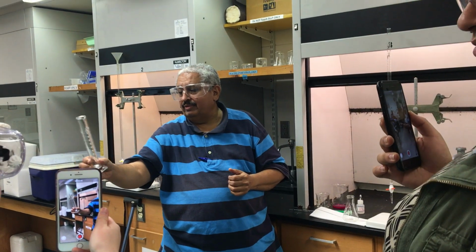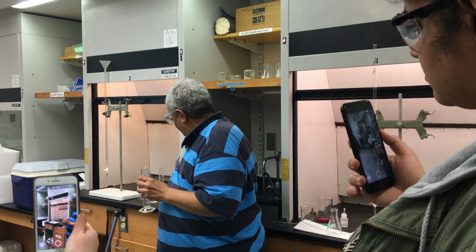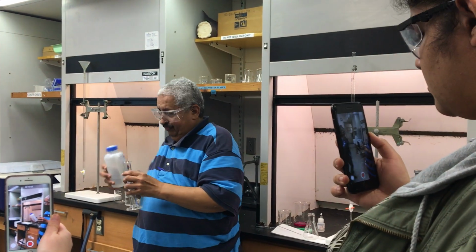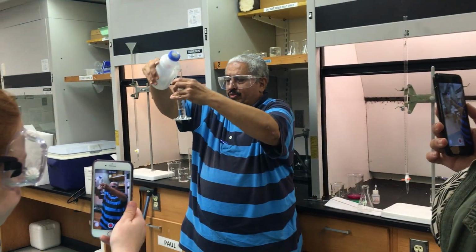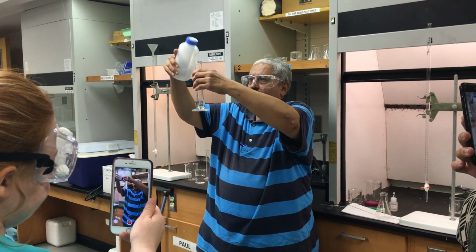Use the bottle here. Yeah. Here, this one? Okay, that's good. Let's add 10 mL. Now suppose I added 15 by mistake. That's fine. So 10 mL. That's about 10 mL, yeah, 1 drop maybe.